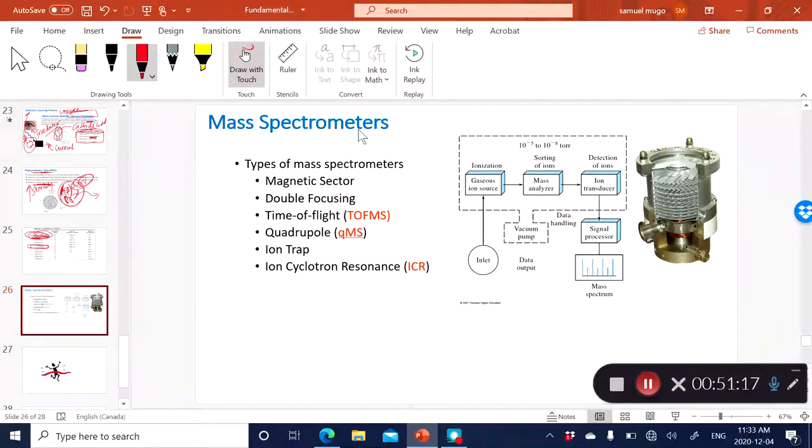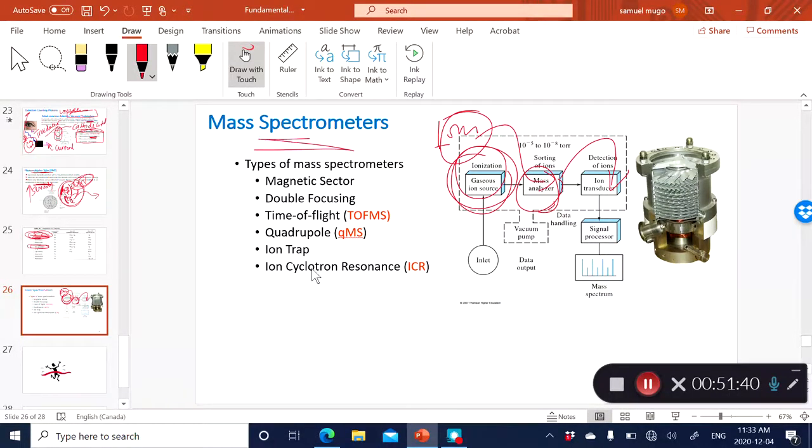Because with the mass spectrometer, you can see the difference. The energy source in this case is the ions. So I've got the ions. And the ions in this case go through a way to separate those ions, and then I've got a way to detect those ions. And that is the basis of mass spectrometers.